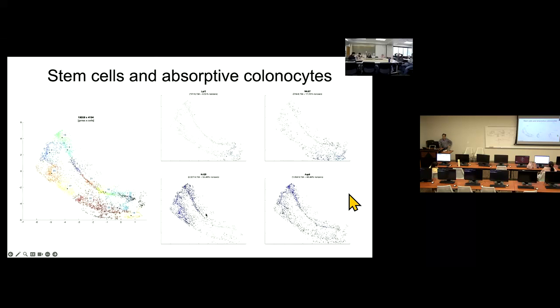And then there's some differentiation markers that I use. I like to use KRT20 to identify the absorptive colonocytes. And aquaporin 8, this is, of course, a receptor that is responsible for pulling water into the cells. And that is what I use to identify the late absorptive colonocytes. I don't believe I actually have an image of that, but this is what I'm currently working on right now. This is what I've had to do to be able to identify these cell clusters.